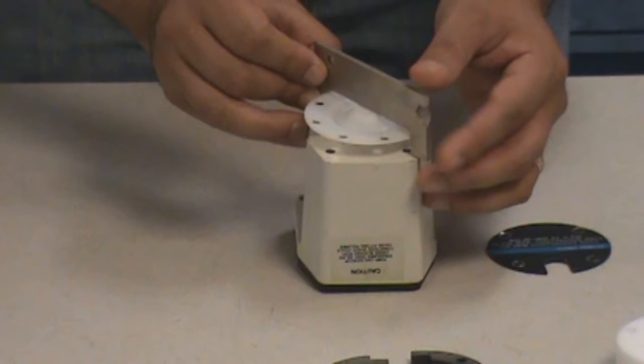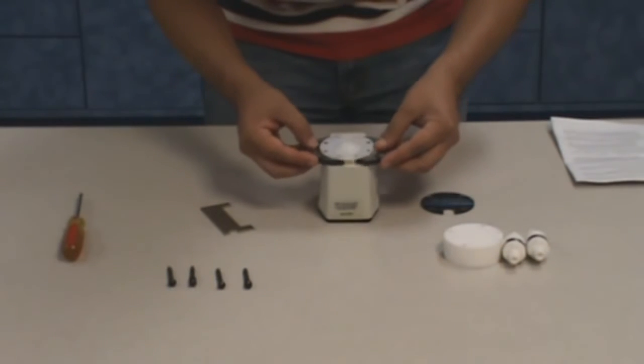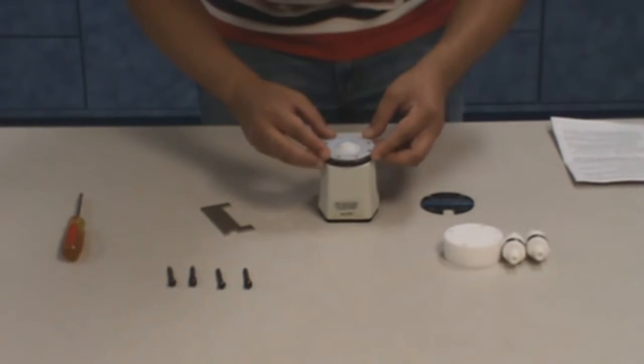To obtain maximum durability from the new diaphragm and to prevent it from striking the reagent head or the pump body, adjust its height correctly by using the gauge provided. Replace the spacing ring segments between the pump body and diaphragm.